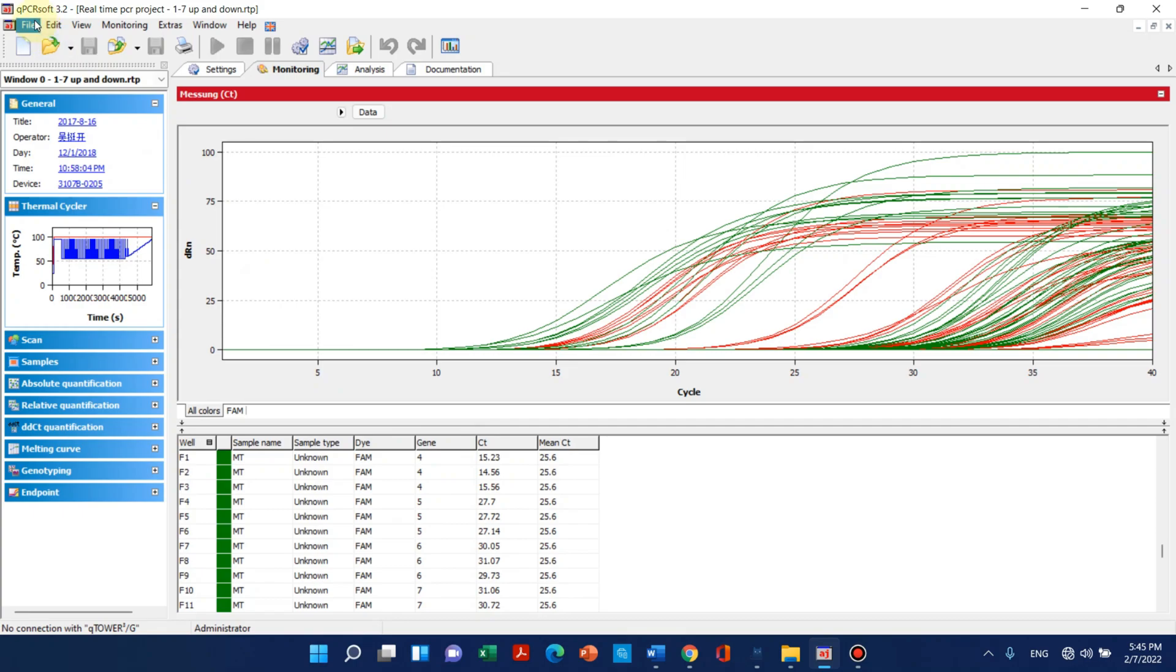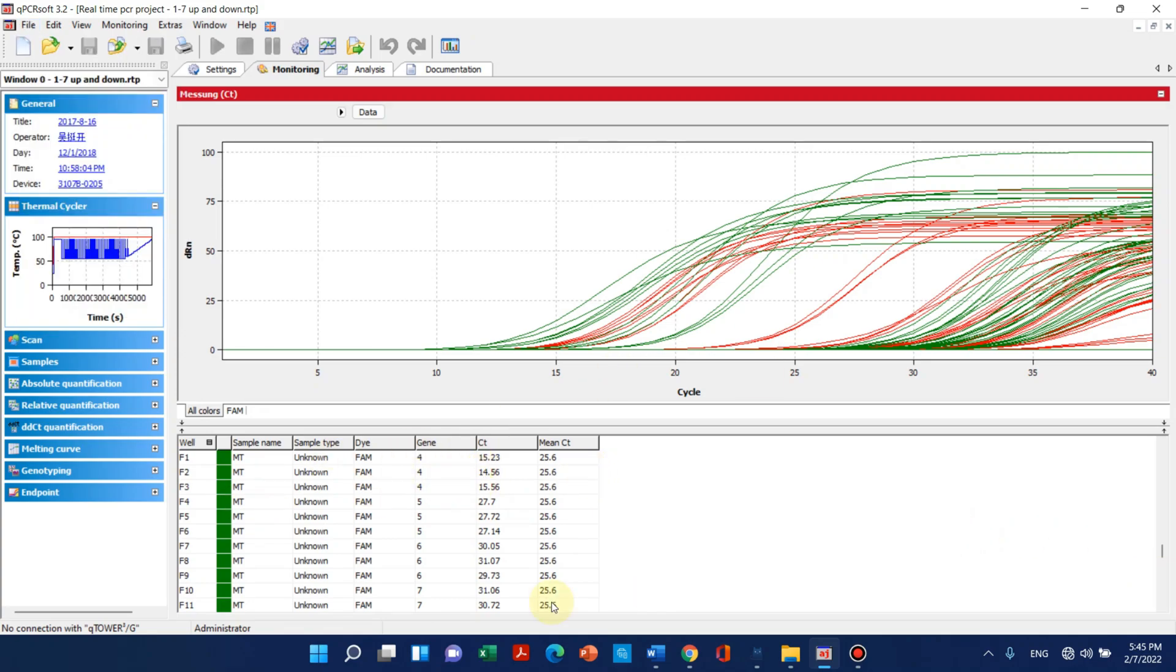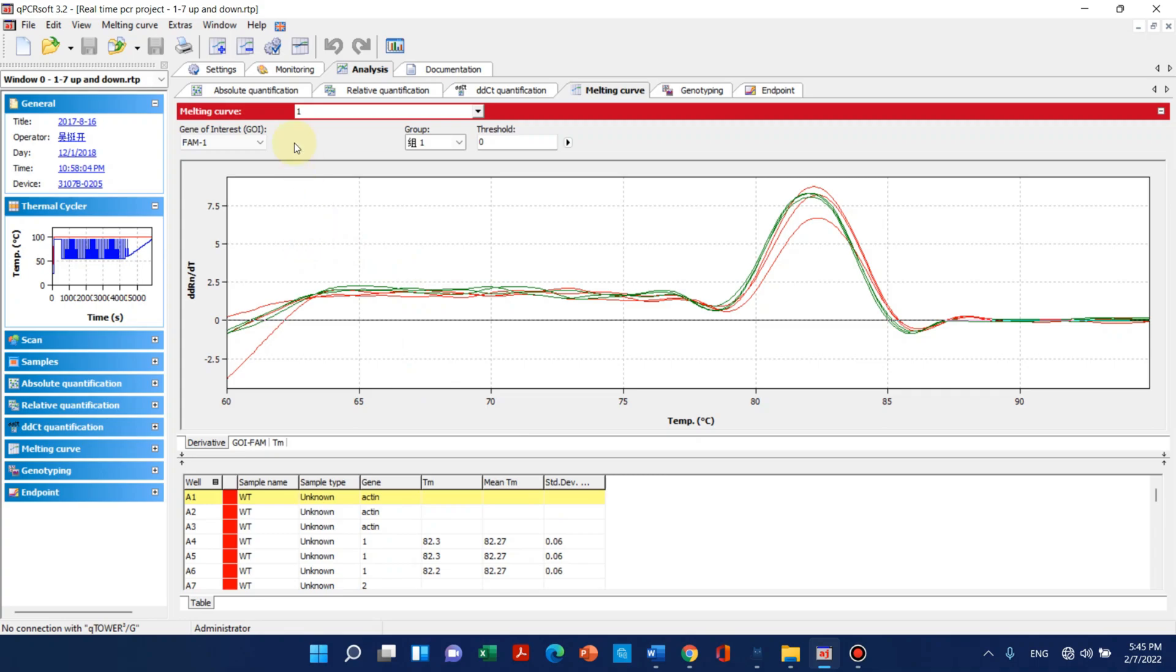This was analysis. We can also compare if we want. We can just compare each one. So this is the delta-delta CT method quantification. We can also compare any one and make the graph here inside this software.